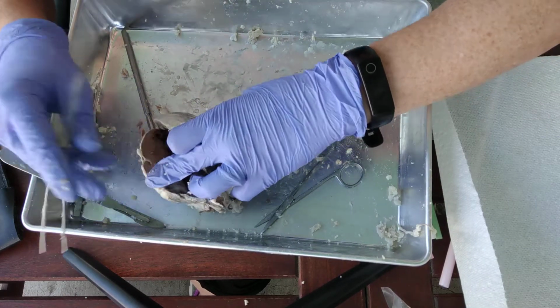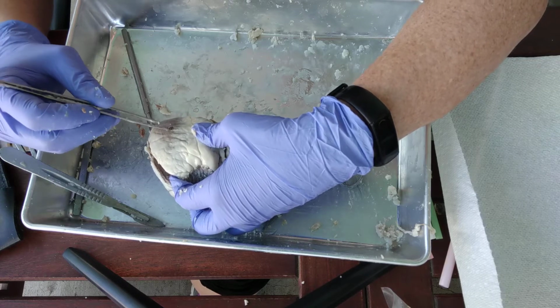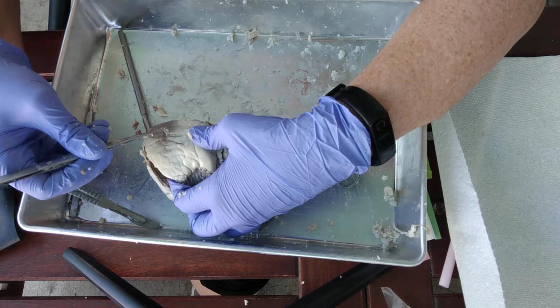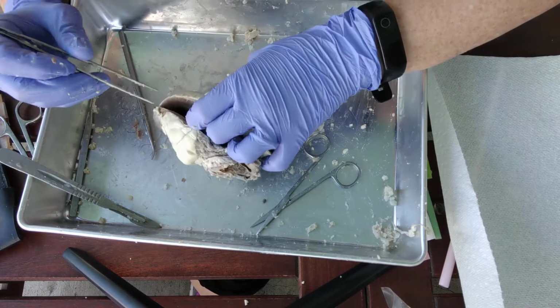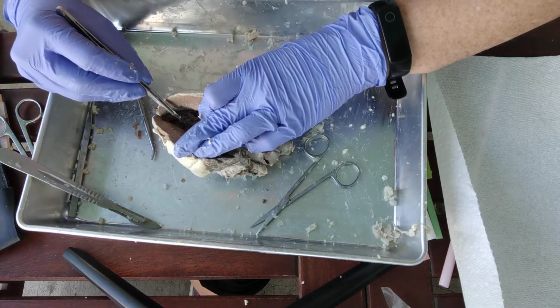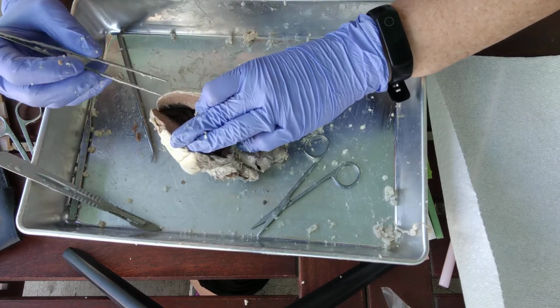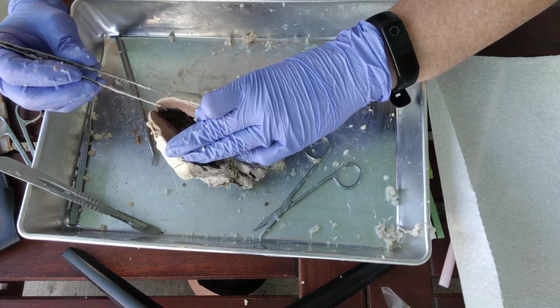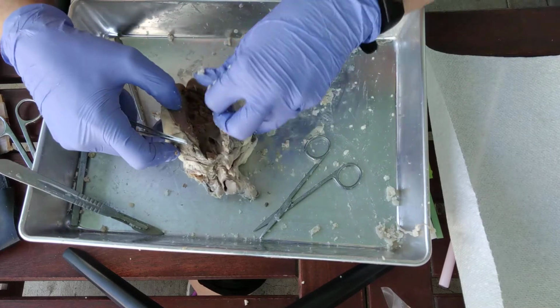So the endocardium is going to be, you know how the epicardium, the visceral pericardium, is the membrane that's on the outside of the heart. Okay, that's the epicardium or the visceral pericardium. The membrane that is on the inside of the heart that is lining the chambers themselves, so the shiny layer inside the chambers, that is going to be the endocardium. Endo as in inside. Okay, so this is the bicuspid valve.